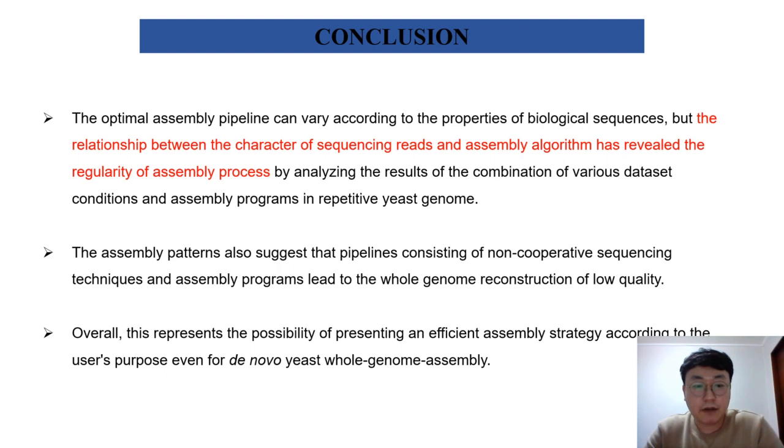So, let me organize the conclusion. We figured out the relationship between the character of sequencing reads and assembly algorithm. This revealed the regularity of assembly process by analyzing the results of the combination of various dataset conditions and assembly programs in repetitive yeast genome.